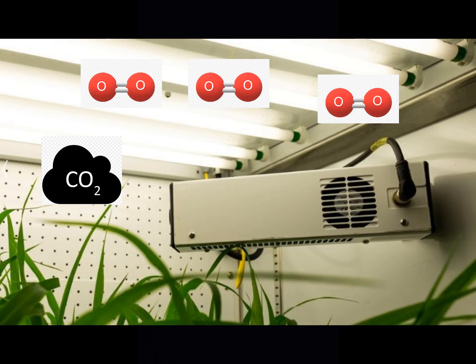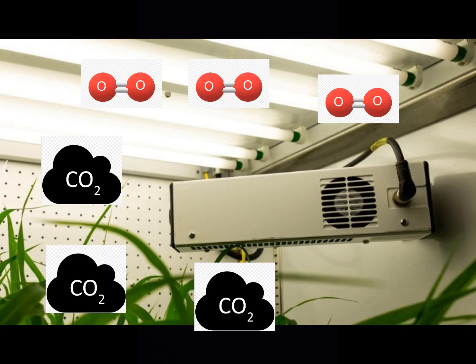Typically, this fan is placed in the regions of the chamber where a carbon dioxide deficit is most likely, such as right next to a dense region of plants. Therefore, this fan is the key to maintaining equilibrium in the chamber so the plants have enough CO2 to go about doing photosynthesis and to grow properly.